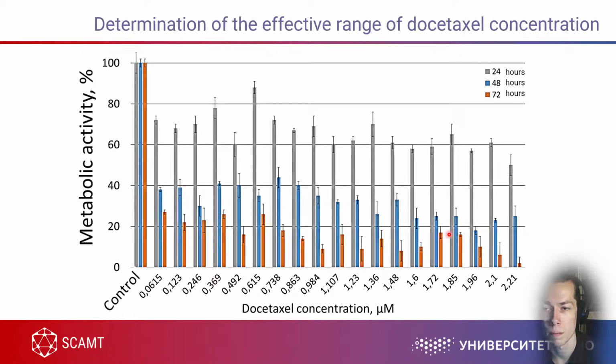But until division, until mitosis, the cell can easily survive even a high concentration of that drug, because there is nothing connected with tubulin outside of mitosis. And what we see here is a wide range of different concentrations of the drug, from nanomoles to micromoles. And we see incubation for 1 day, 2 days, and 3 days.